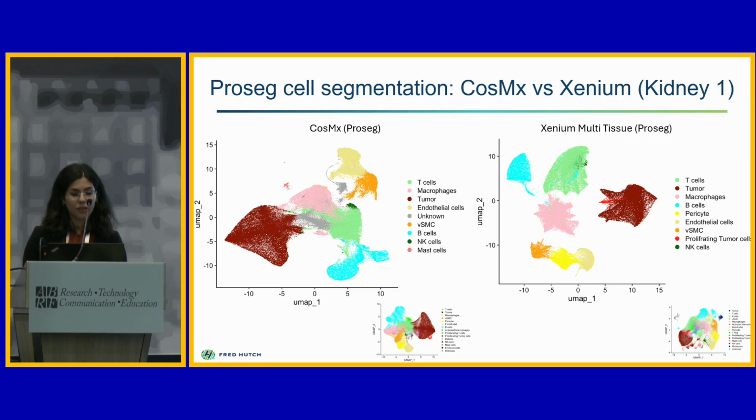And then the other thing that you mentioned, in terms of the images, yeah, I didn't have any images here, but we also saw that for Xenium there were some transcripts outside of the cells. It is important to see that those are not called cells, so those will be discarded. But if I'm doing 1,000 probes in situ, I want to see where all my probes are. The fact that people are only looking at cell-identified transcripts for clustering comes from RNA-seq and single cell, but we want to see everything, right?